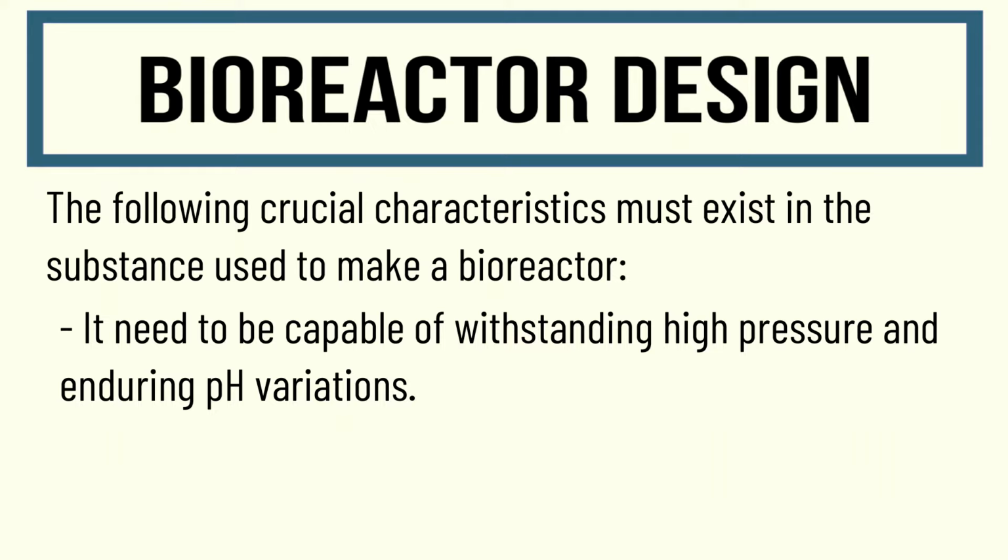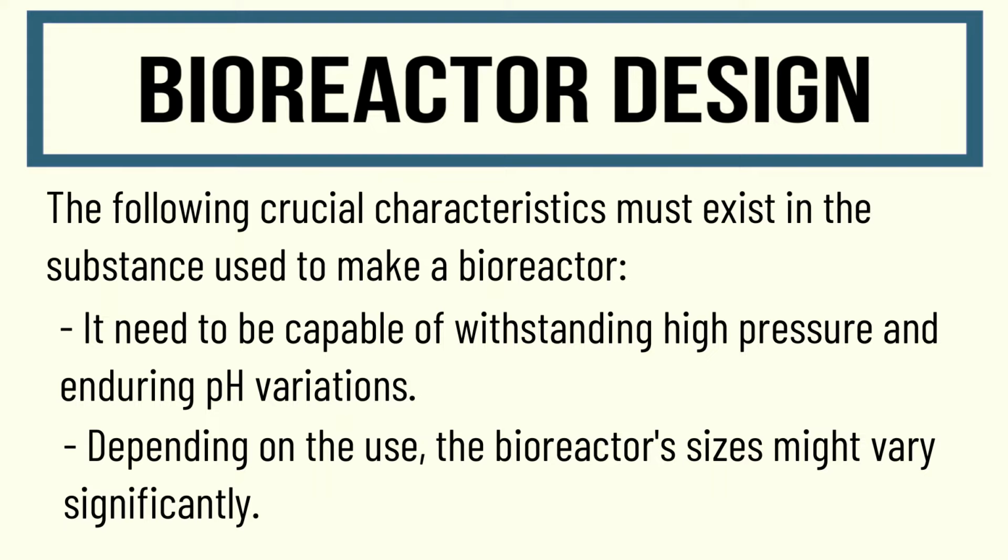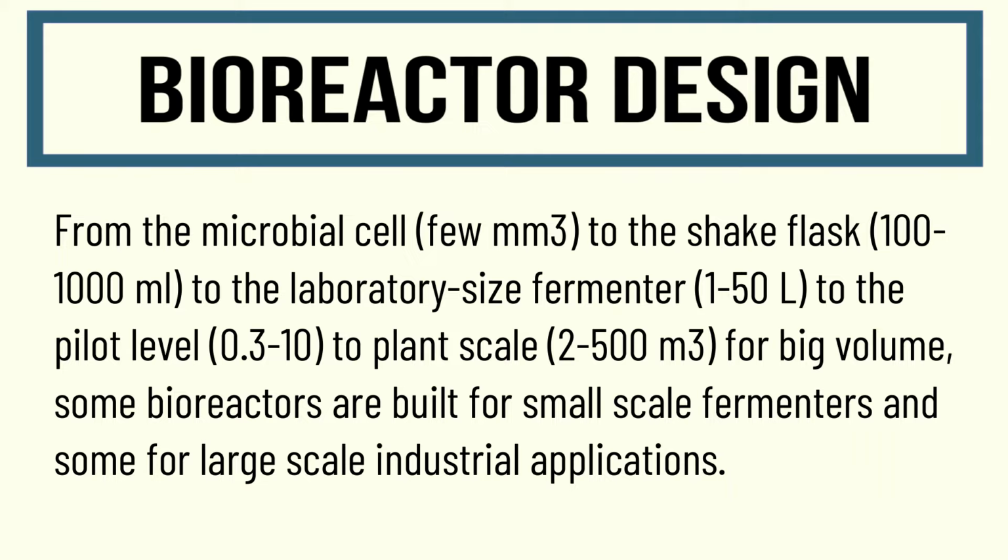Lastly, depending on the use, the bioreactor's size might vary significantly. From the microbial cell to the shake flask to the laboratory size fermentator, to pilot level, to plant scale for big volume, some bioreactors are built for small scale fermentation and some are large scale industrial applications.